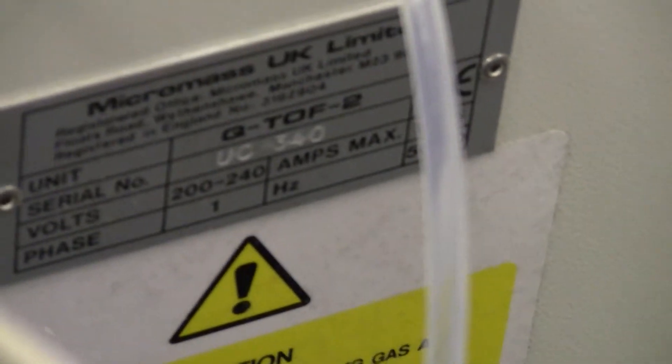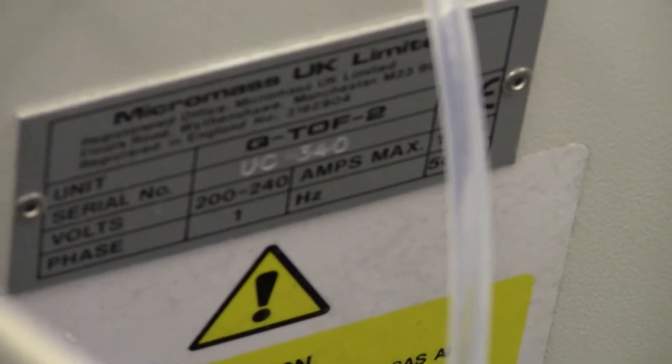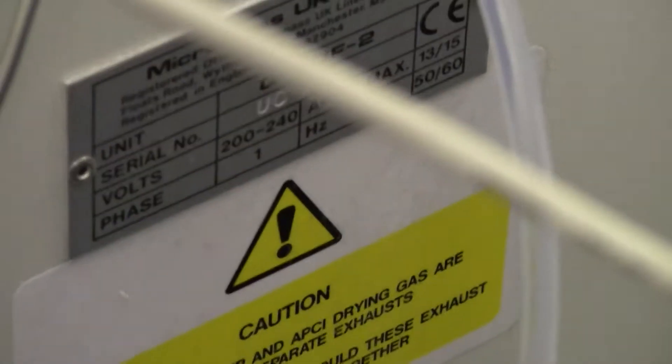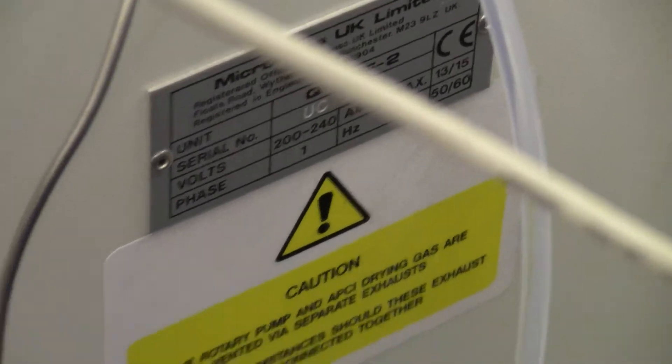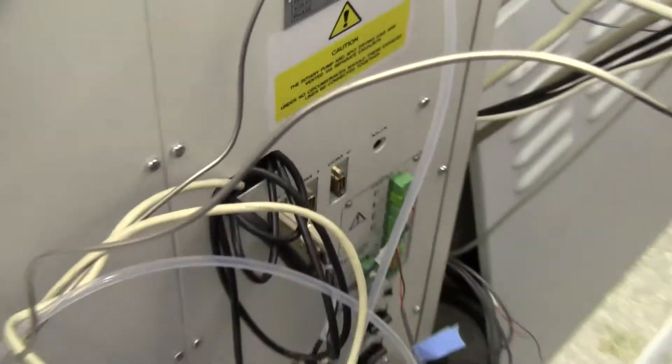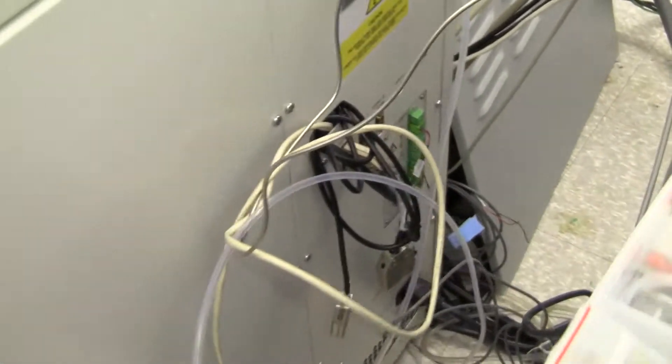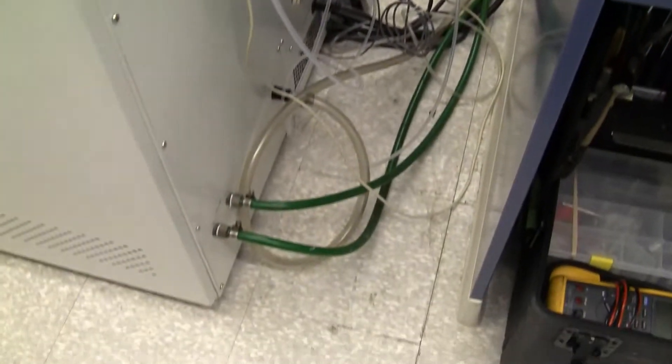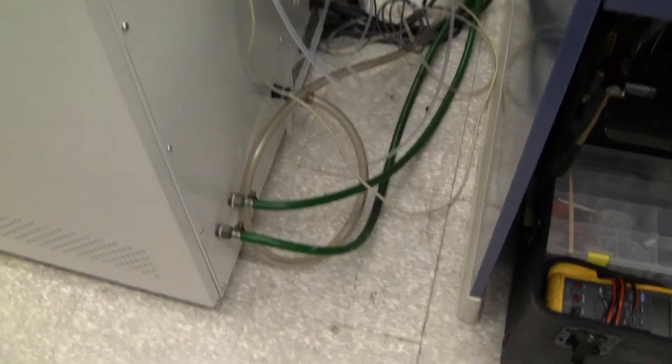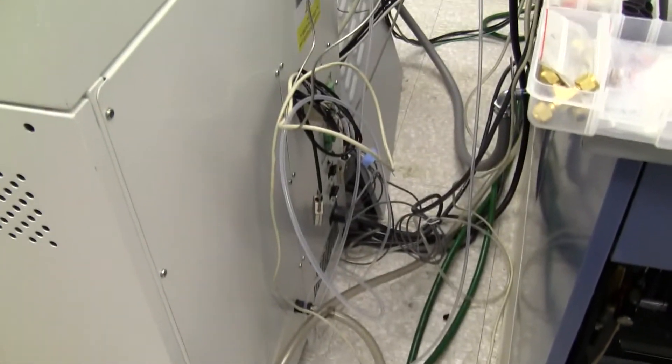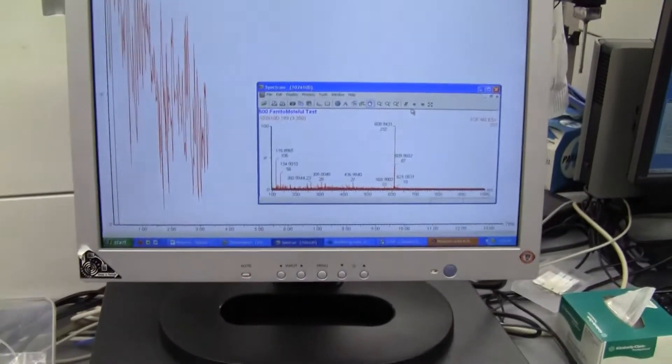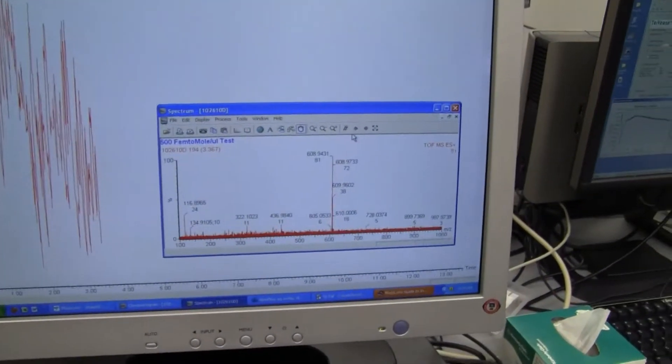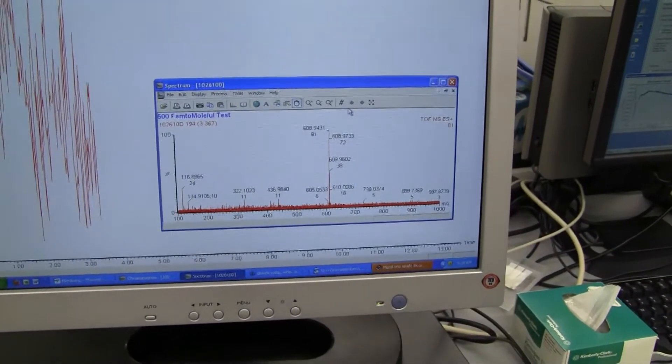Serial number is UC340. It is a single phase, 200 to 240 volts. There are circulation lines and we can see the mass spec is working properly.